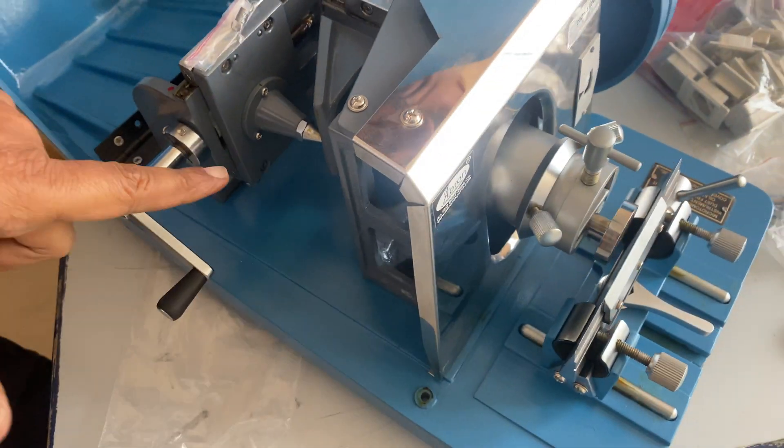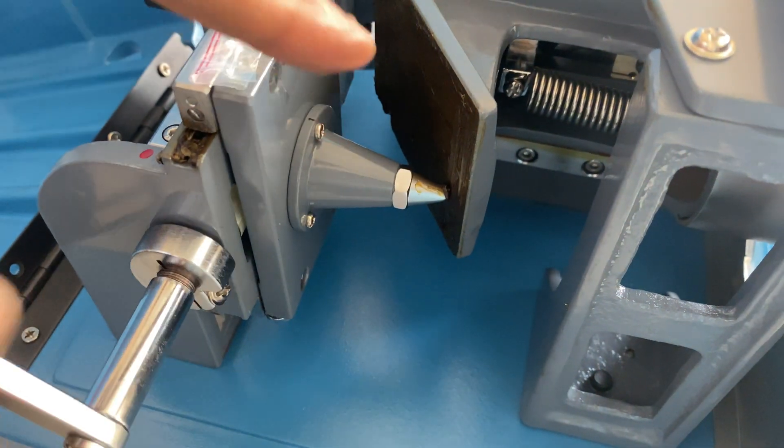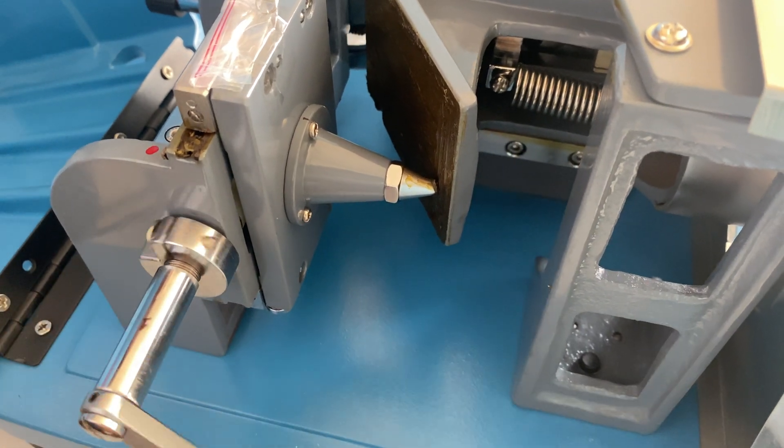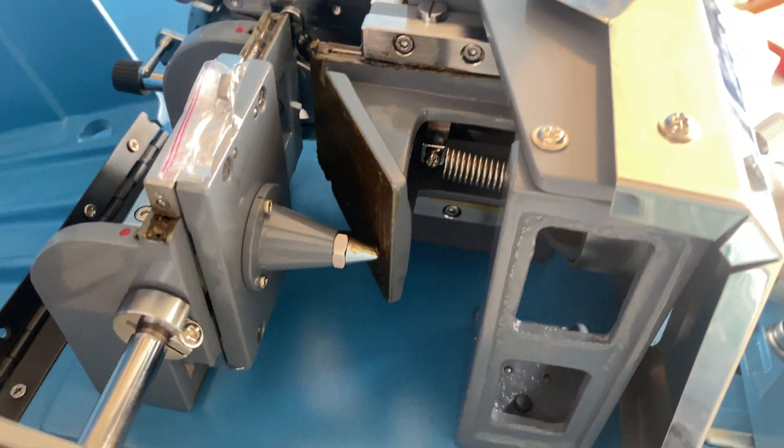If you want to move the block forward or backward, there is one wheel here. It moves this section, and if you move it, the wheel also moves and this section also moves, so that you can make it go forward and backward.